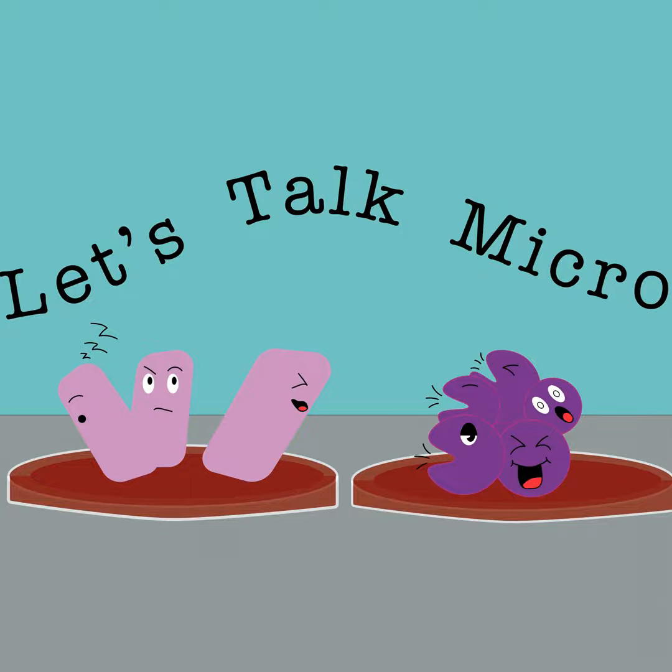It helps you with the understanding of how the electron microscope operates and what you would actually visualize with the electron microscope, different from when you're just looking at pictures of it. So that was a different experience. And then actually getting their hands onto a microscope and focusing, that was a very different, great experience for them to have. And they all liked being able to do both. I think that they found both to be very, very useful and fruitful.